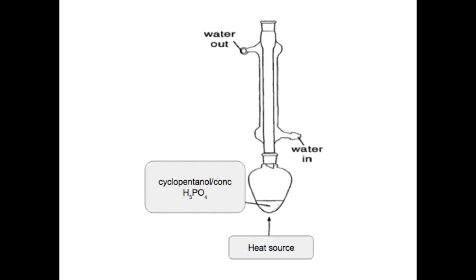This is what the reflux apparatus looks like. The condenser is in the vertical position — water goes in at the bottom and out at the top, giving the most efficient cooling of the vapour in the inner glass tube. The pear-shaped flask contains the reaction mixture of cyclopentanol and concentrated phosphoric acid, with the heat source below, whether a water bath or heating mantle.